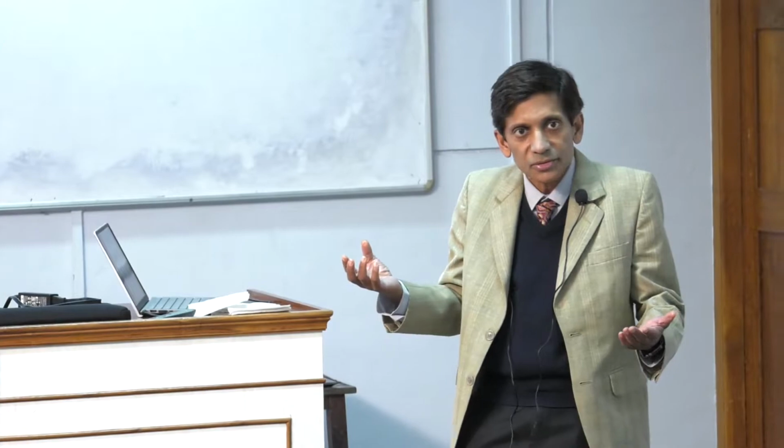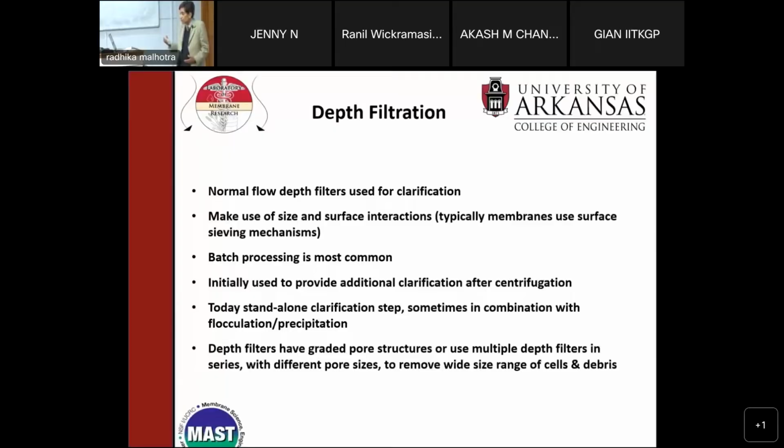particulate matter. So often depth filters were used as a second operation after something like centrifugation. But today there are standalone depth filters that are used without anything else. So you are using perhaps flocculation precipitation and then the depth filter.